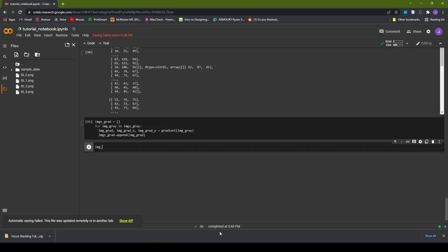And to do that, we're going to write the following line of code. We're going to say image_gray_focused, image_color_focused, and image_labeled equals. And we're going to be referencing one of the functions defined in the code at the very first cell. That is construct_focused_image. And as a convenience, you notice this highlight here.